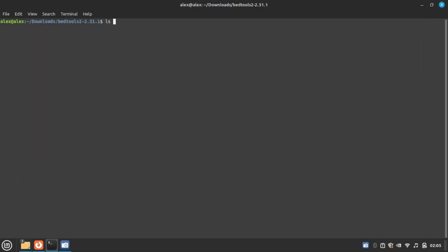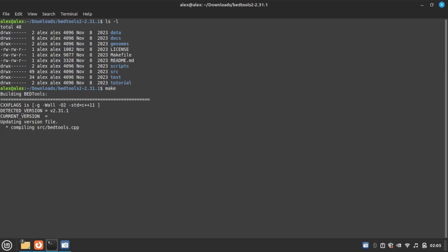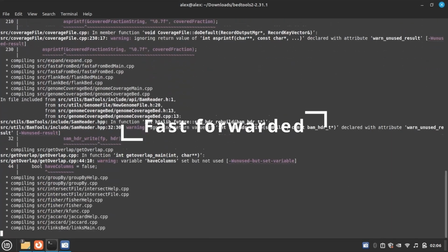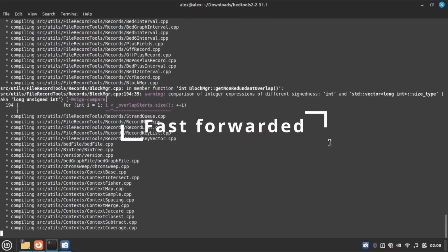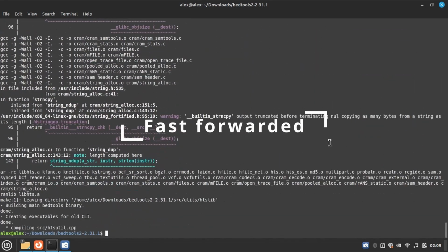So let's check it. To install it, you have to write the command make and enter. Okay, the installation is done.